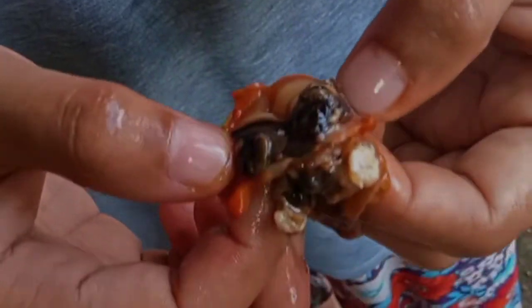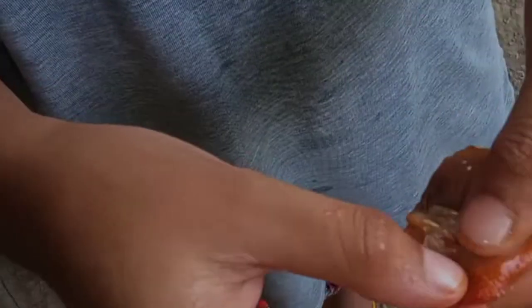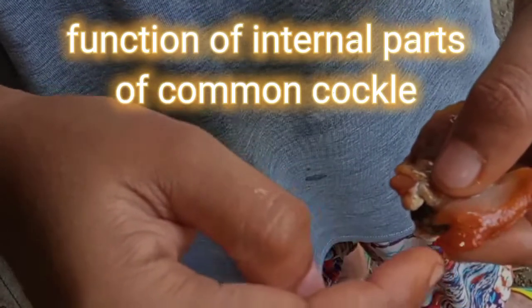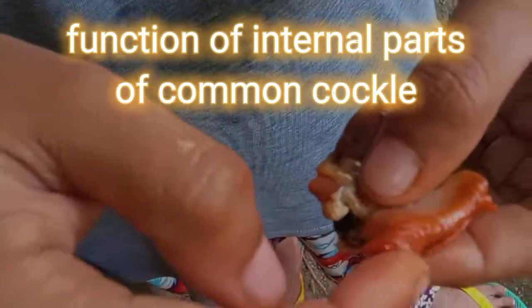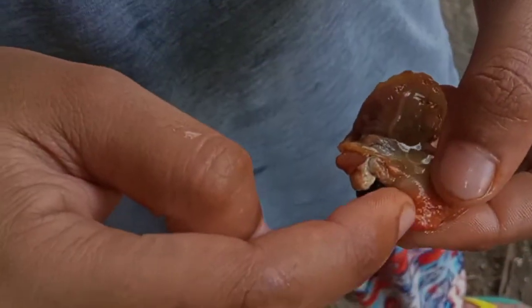This part is what we call the gonad. This is the foot. At the base of the visceral mass is the foot. In species such as the common cockle, it is a well-developed organ that is used to burrow into the substrate and anchor the animal in position.